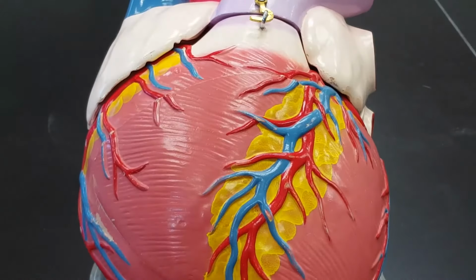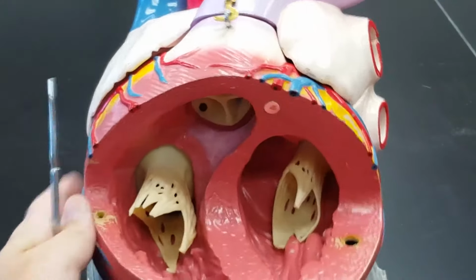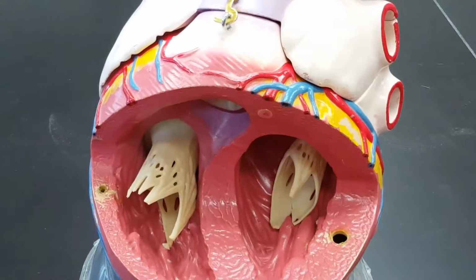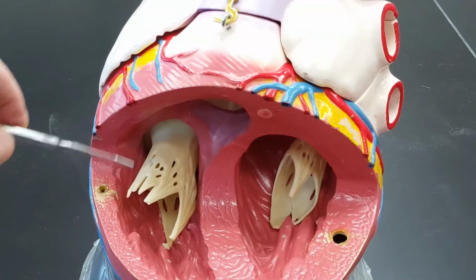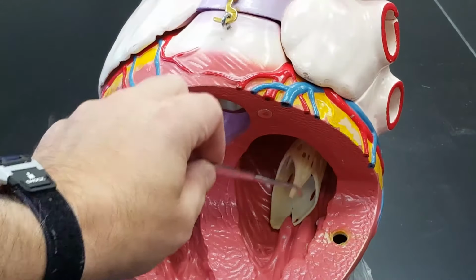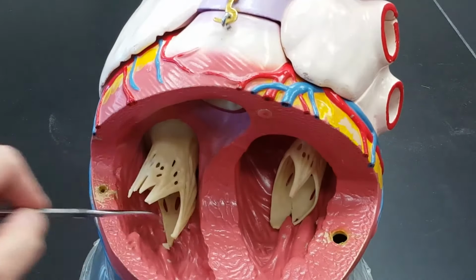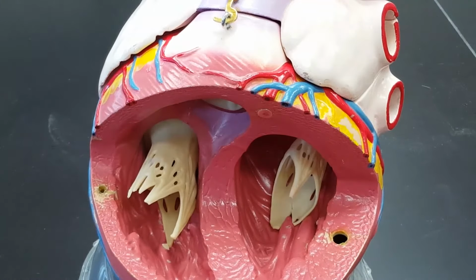Now let's look at jumbo. Right here. So I can see the cords, chordae tendinii, right here, and papillary muscle at the base of the cords, papillary muscle. Chordae tendinii and papillary muscle are actually considered modifications of the endocardium.